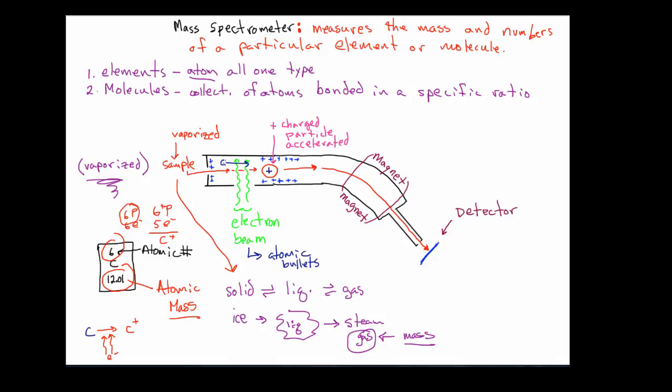The interior of the instrument at this point in this narrow hallway carries a positive voltage. So what's going to happen now once this particle has got a positive charge on it is it's going to be accelerated down the hallway. The reason being is because now the particle has the same charge on it as the voltage in the hallway. All right?